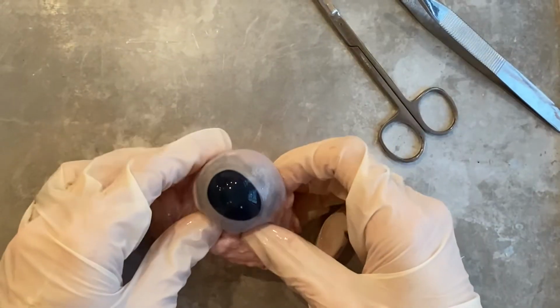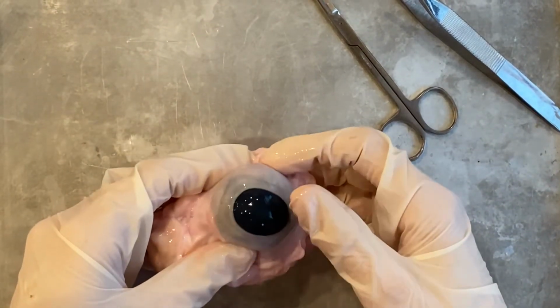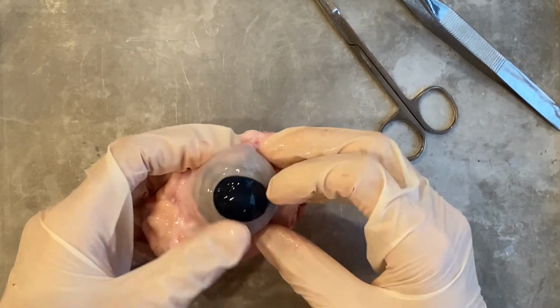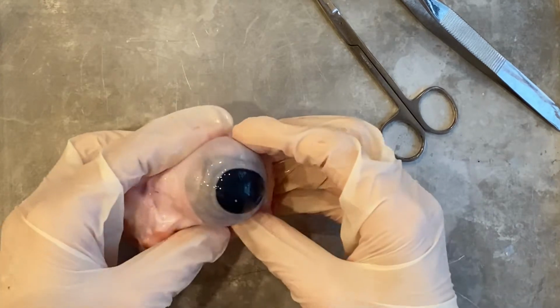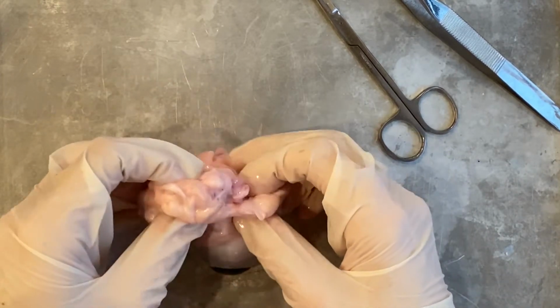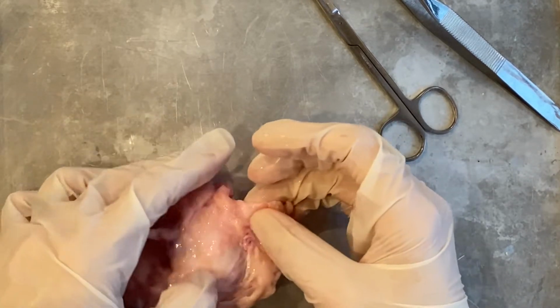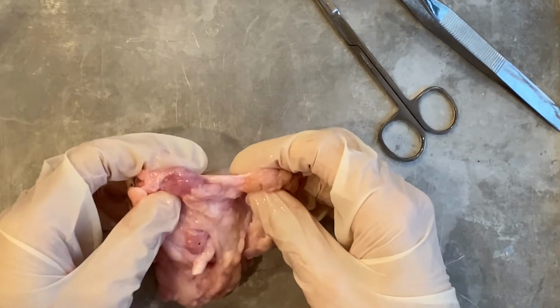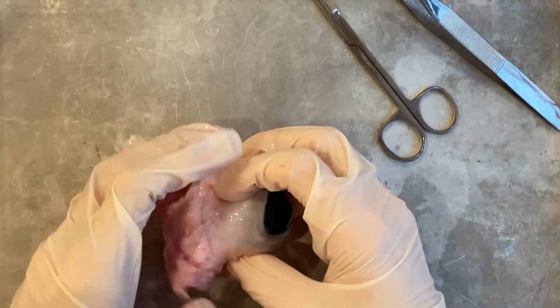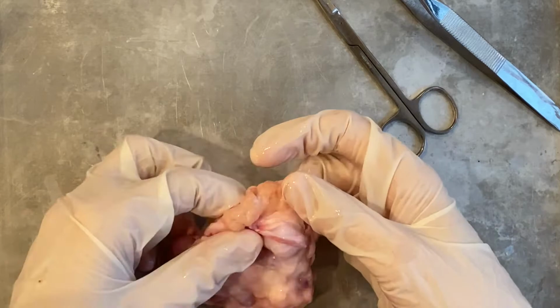So here's our cow eyeball, and we have the, let's see, the cornea, which is clear in the middle. Then we have the sclera, which is white on the outside, surrounded by a whole lot of fat and muscle tissue that's been left on here. So we are about to cut that off with our dissecting scissors.